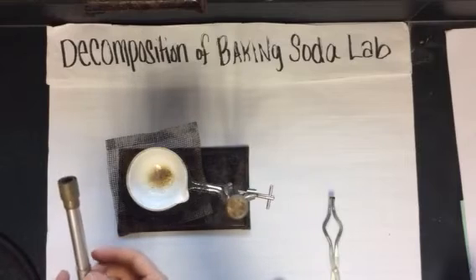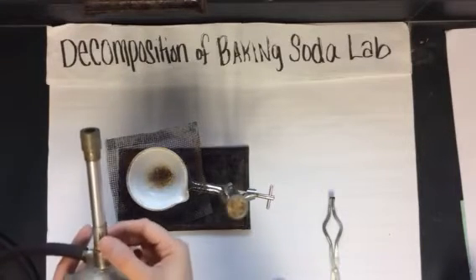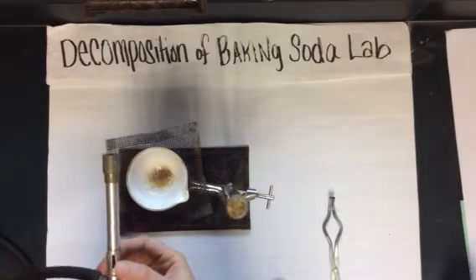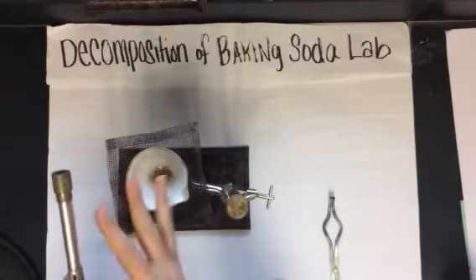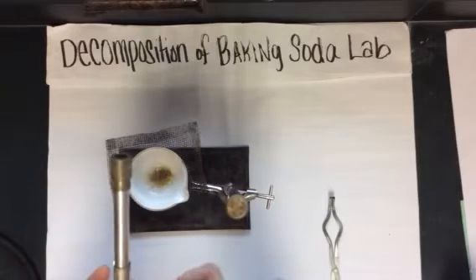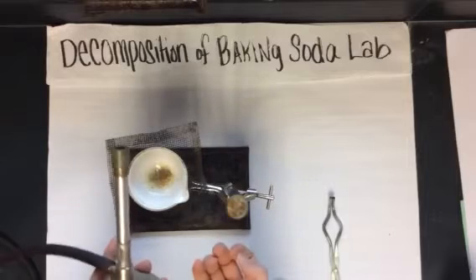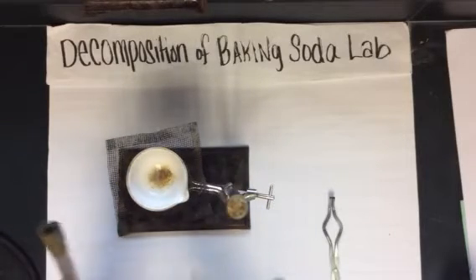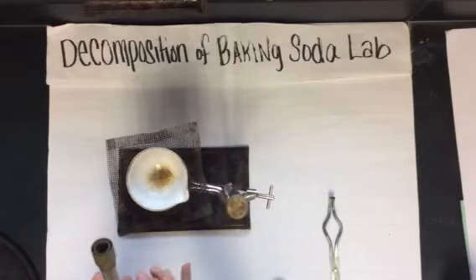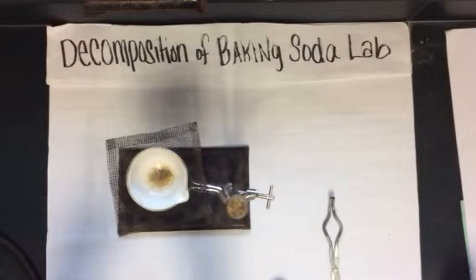Also, on some of your Bunsen burners, you might see these little vents down here. These vents let in oxygen. So if you have too much oxygen coming in, that could be interfering. But if they're completely shut and you don't have any oxygen coming in, then that would be bad. So you want to make sure they're slightly open. You don't want to touch any other features on your Bunsen burner. So adjusting the barrel helps you get the two cones, inner and outer.